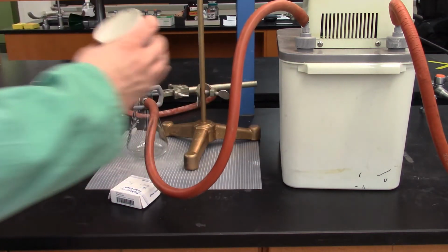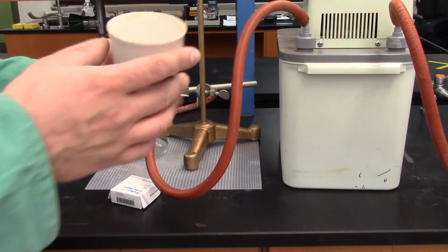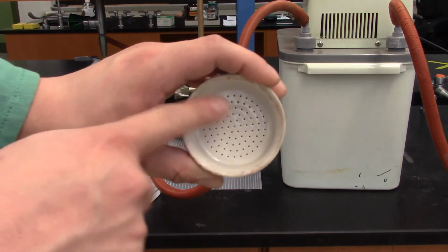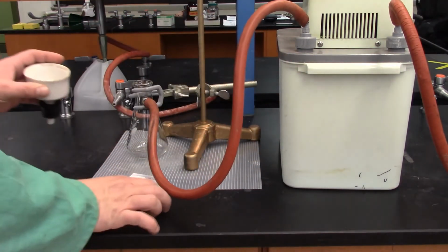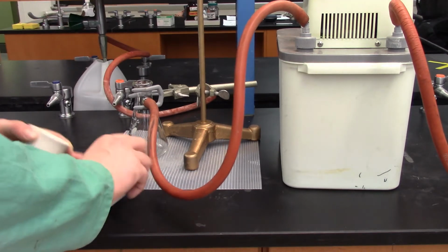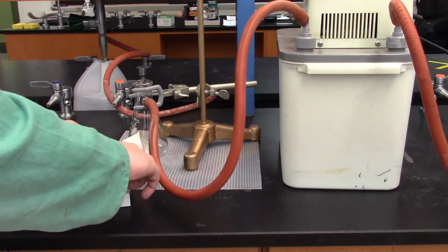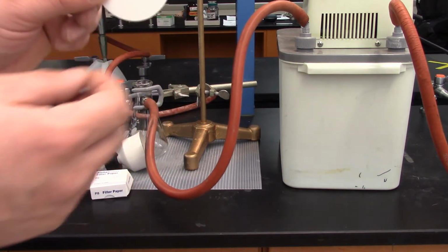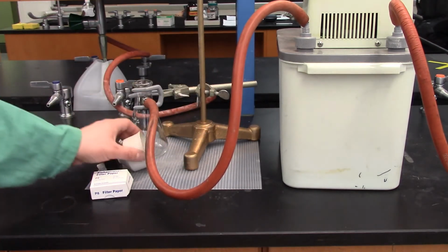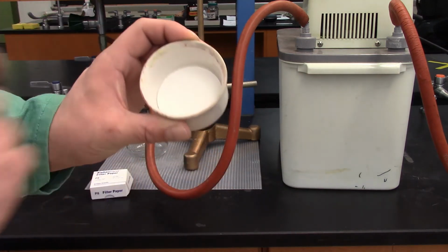As we know, we're going to have to use the Buchner funnel here. So we have our Buchner funnel, rubber stopper, one hole. We have the inside where we'll put our filter paper. We're going to be using the 5.5 centimeter ones, like so. You have your filter paper, make sure that there's only one, because if you have more than one piece of filter paper in there, you're actually going to have a harder time getting your suction going.